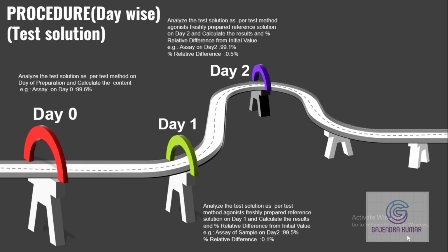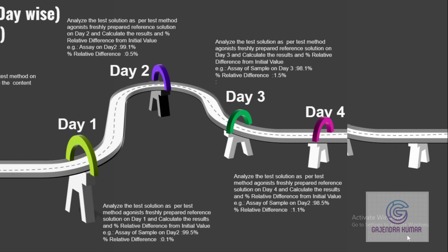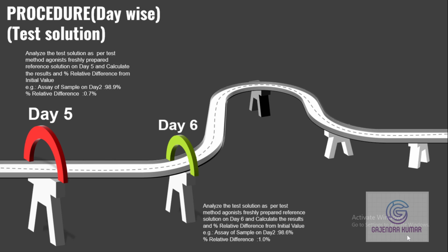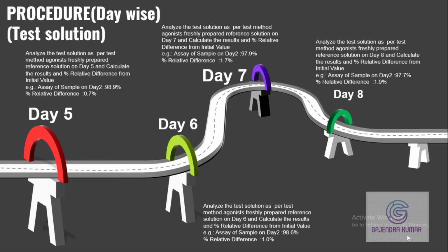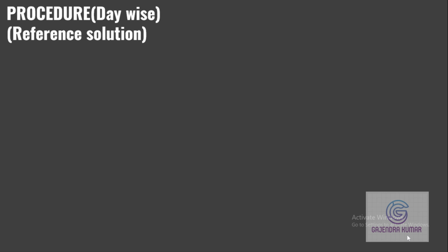Repeat the same procedure on day 3, day 4 and day 5, and continue this procedure up to day 9. So the number of days is your choice. You can continue up to 30 days or you can close in 5 days also. In case of reference solution, it is the same procedure.